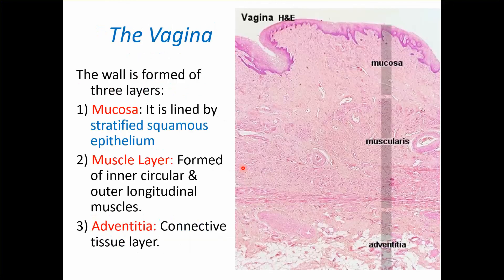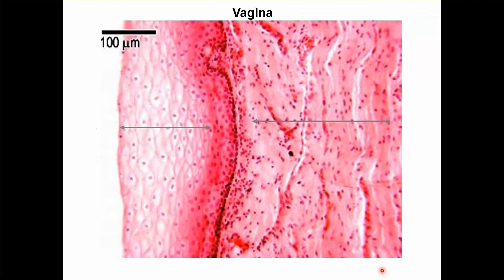Now coming to vagina. There are three layers: the mucosa lined with stratified squamous epithelium, then the muscle layer formed with inner circular and outer longitudinal, and then adventitia which is connective tissue. You can see the stratified squamous epithelium.